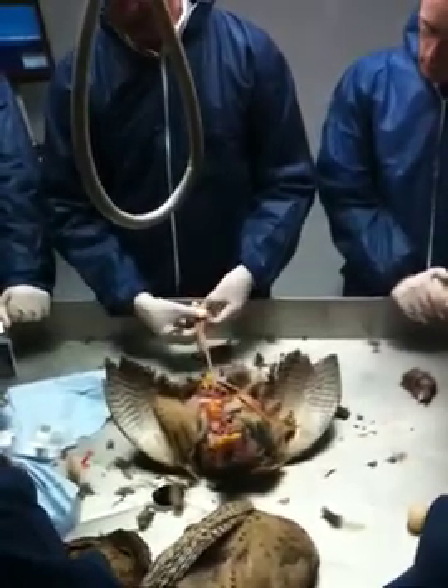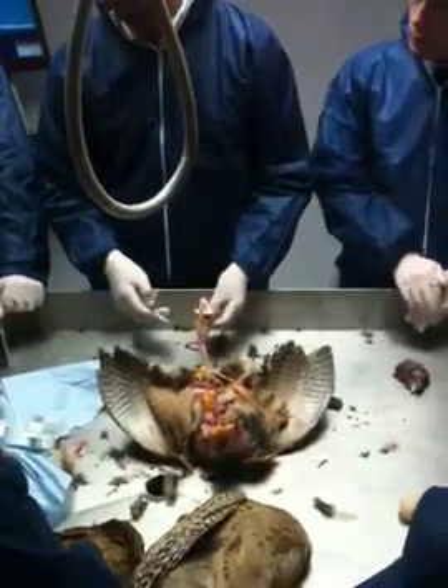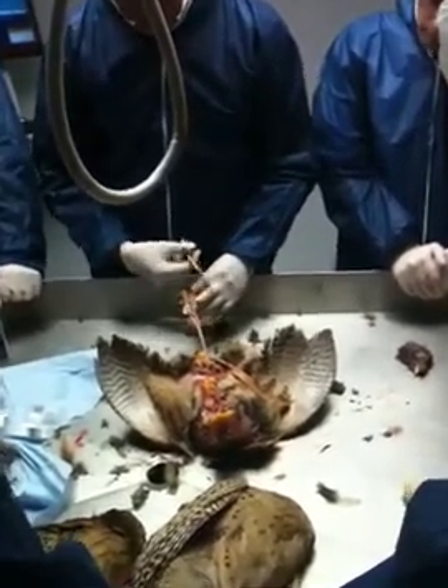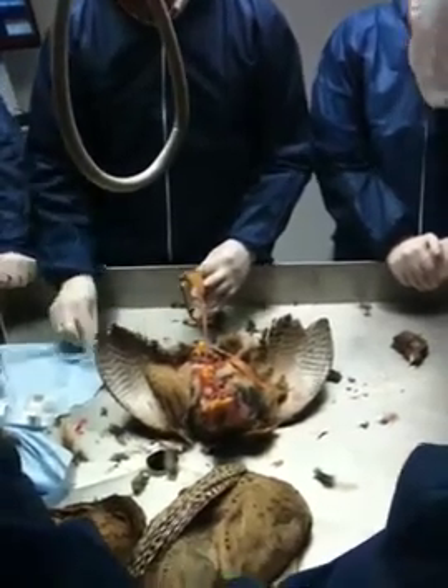If you open up a chicken, they're much smaller again. So the pheasants are somewhere in between the two. So if I just open up the cecum there — have a look — perfectly healthy there again, looks fine.